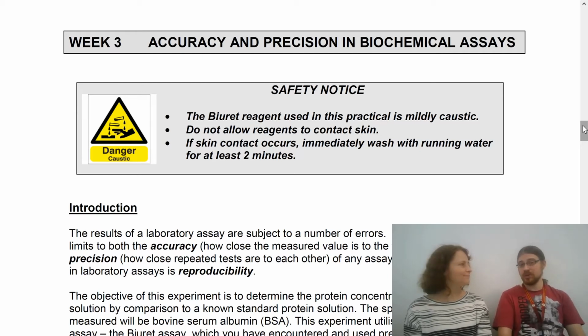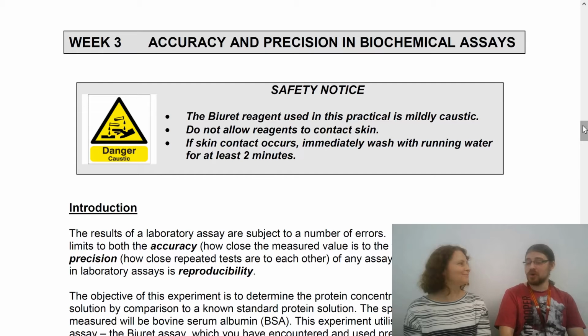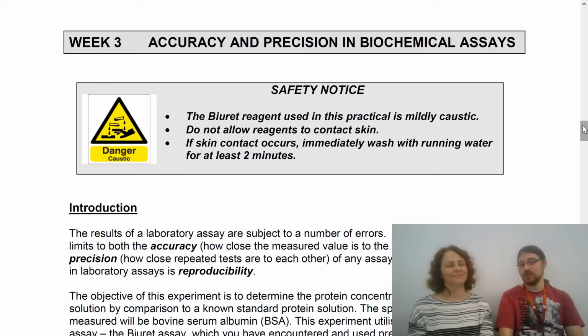So, the main reason that we're doing our replicates for today in checking for the accuracy and precision in regards to a standard is to show how possibly error is introduced. What is one form of error which could possibly be happening with this particular assay? Pipetting. Definitely.